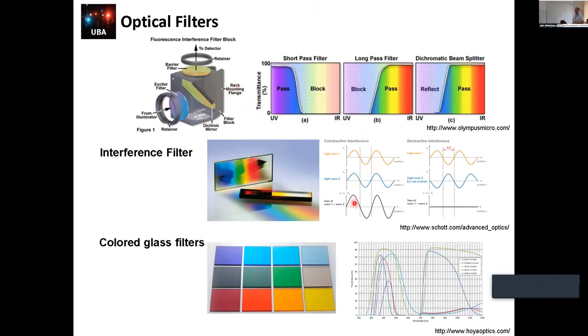An interference filter most of the time works at 0 angle, so it needs to be perpendicular to the beam. If we tilt the angle, it will have a problem. This will be a problem when our photons are scattered, not collimated, not all coherent. This happens when we have fluorescence coming from a high scatter sample. If we use our optics, we usually make the light coherent again and we can handle this.